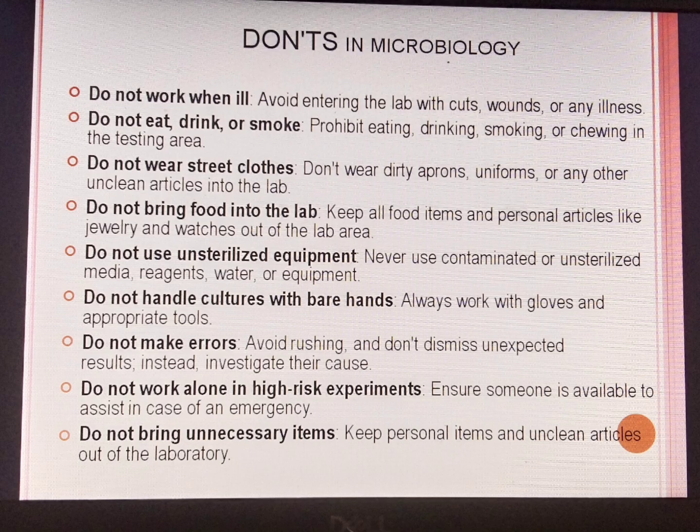Do not wear street clothes. Do not wear dirty aprons, uniforms, or any other unclean articles into the laboratory. Do not bring food into the laboratory. Keep all food items and personal articles like jewelry and watches out of the lab area.